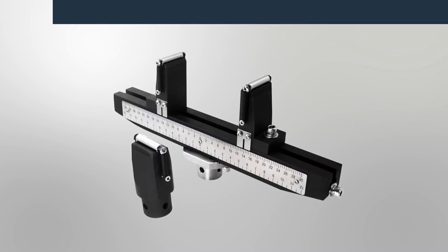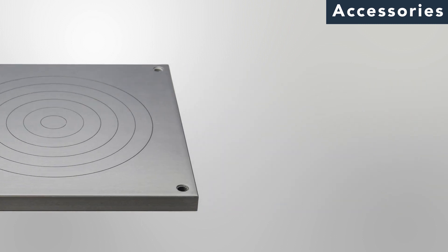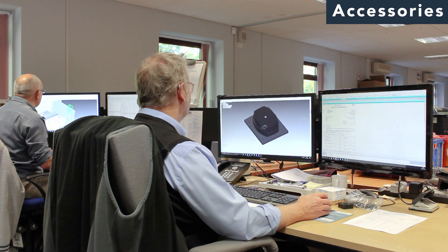As you would expect, an extensive selection of standard grips and fixtures are available to hold your test specimens. For non-standard applications, our team of design engineers will work with you to find a solution to meet your requirements.